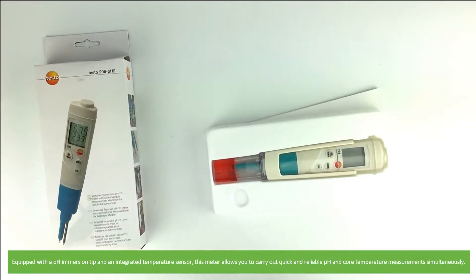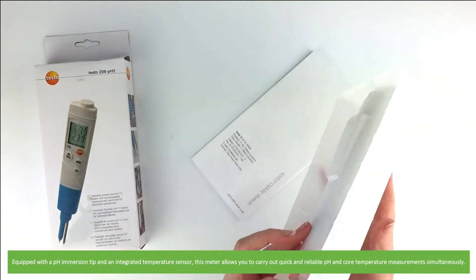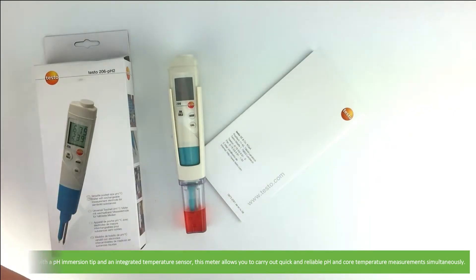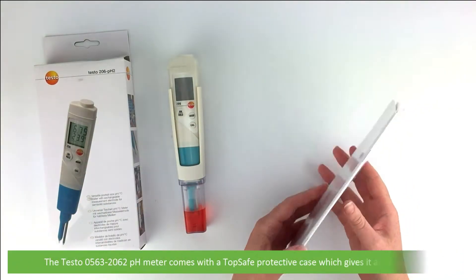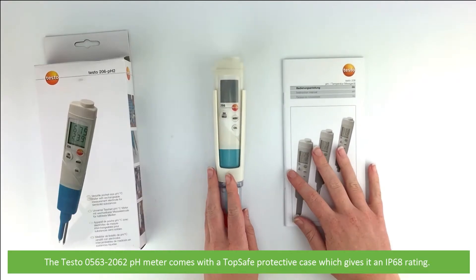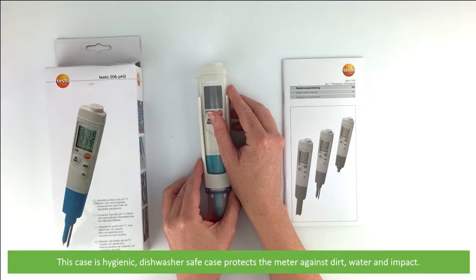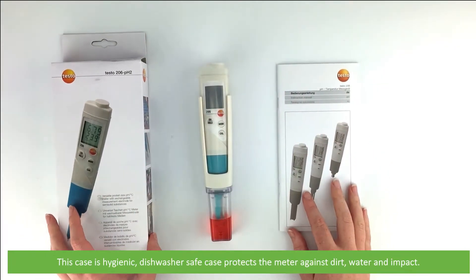Equipped with a pH immersion tip and an integrated temperature sensor, this meter allows you to carry out quick and reliable pH and core temperature measurements simultaneously. This pH meter comes with a TopSafe protective case which gives it an IP68 rating. This case is hygienic, dishwasher safe and protects the meter against dirt, water and impact.